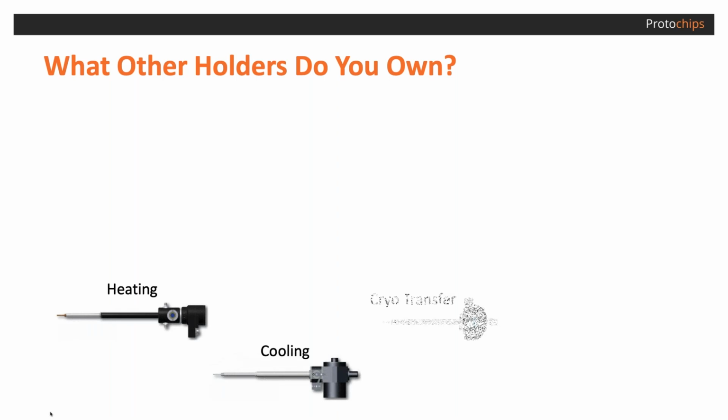So lots of people have MEMS-based in situ holders now, but everybody's got a bevy of holders in their lab, and I'm willing to bet that some, if not all of you, have a lot of these holders. Bulk heating furnaces, cooling and cryo transfer systems, tomography, strain, helium. There's so many different holders that people use that are all dynamic, all in situ at some level.